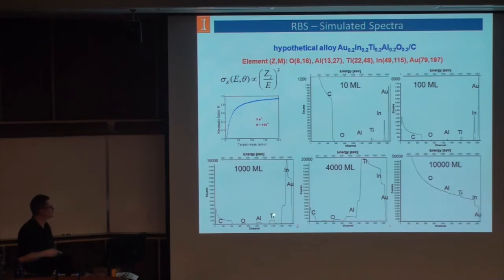You now have the front surface information and then the back surface information of the film. So it goes up, has a plateau, comes off, because the concentration isn't changing throughout the thickness. And then you can also see, as we go to thicker and thicker, our maximum counts are going up higher, because we're getting more and more counts. And then finally, as you go thicker and thicker, eventually everything works its way together. And so it does put a maximum thickness onto what you can use effectively with the technique.